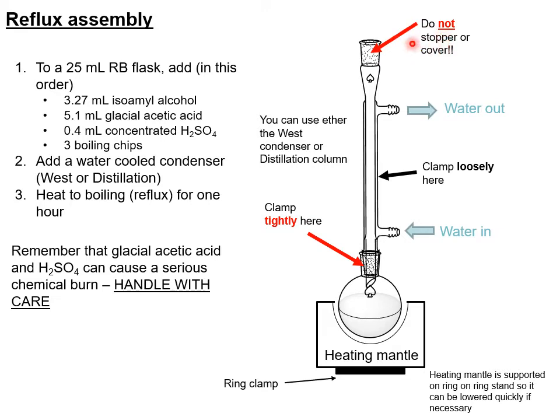One thing you want to keep in mind is you don't want to cover this. You don't want to have pressure build up and things blow up, and that's a problem, right? So you want to keep this open to the air. It's okay. None of this will actually come out because it'll cool down and drip back down into the reaction.